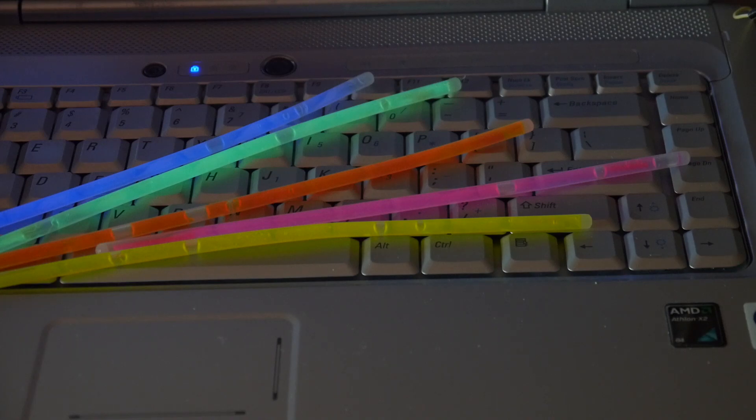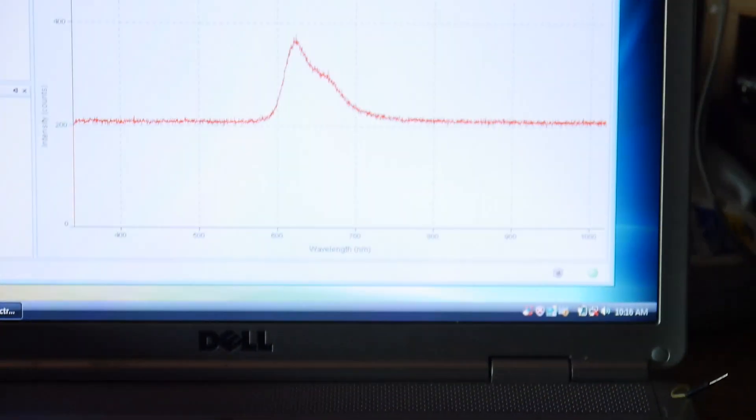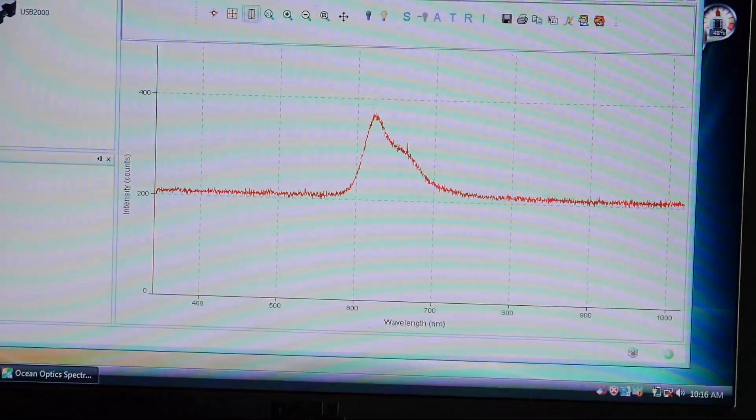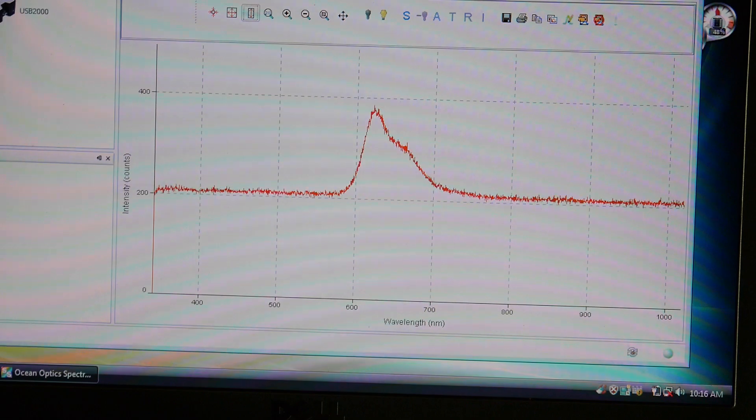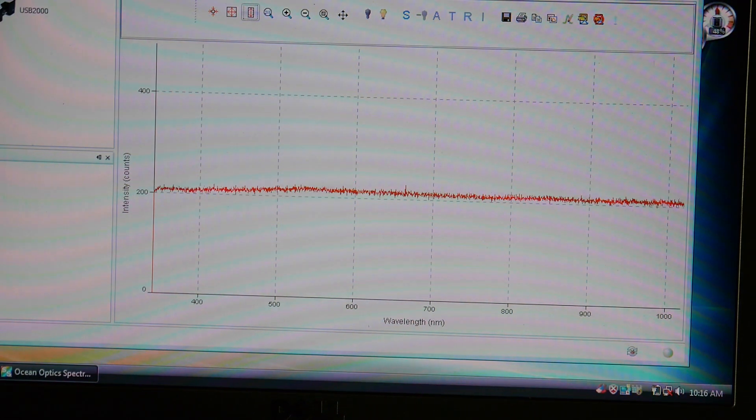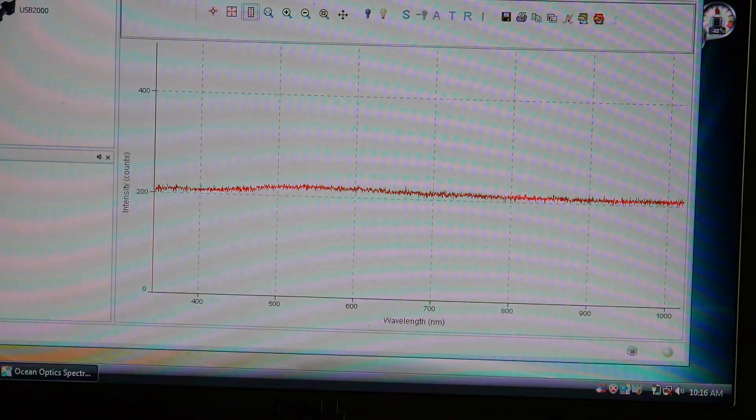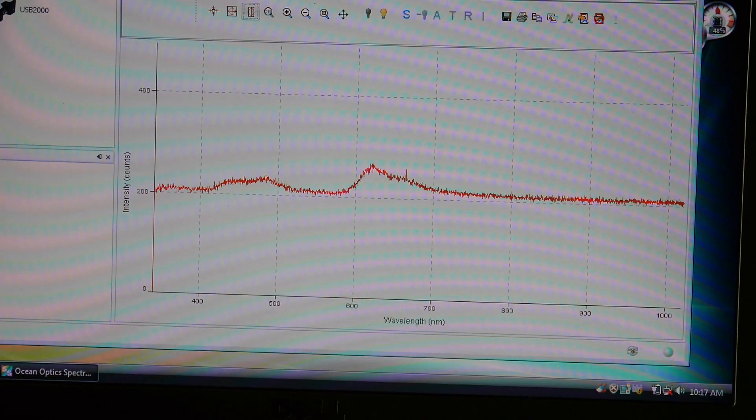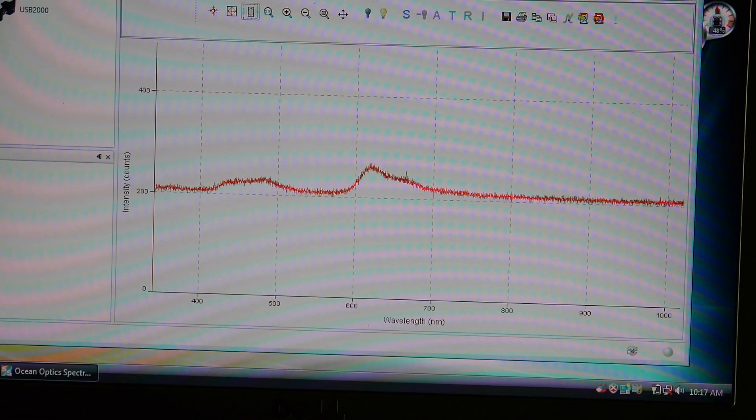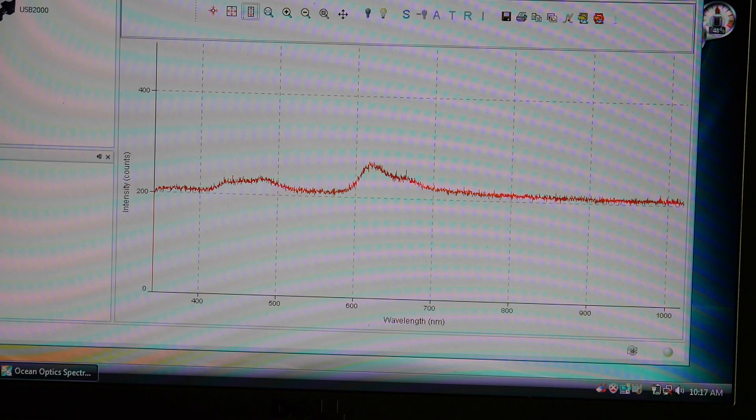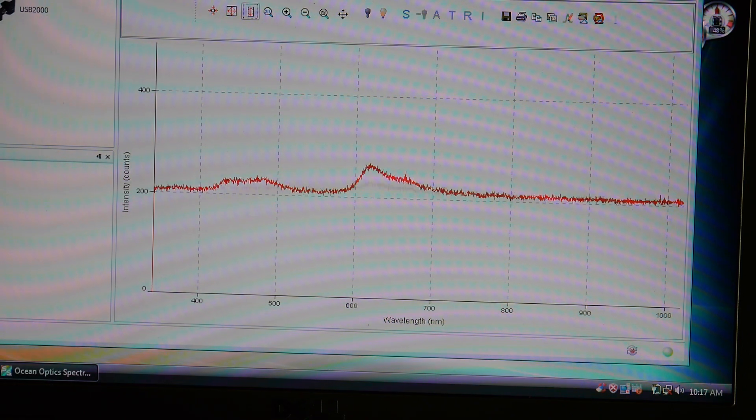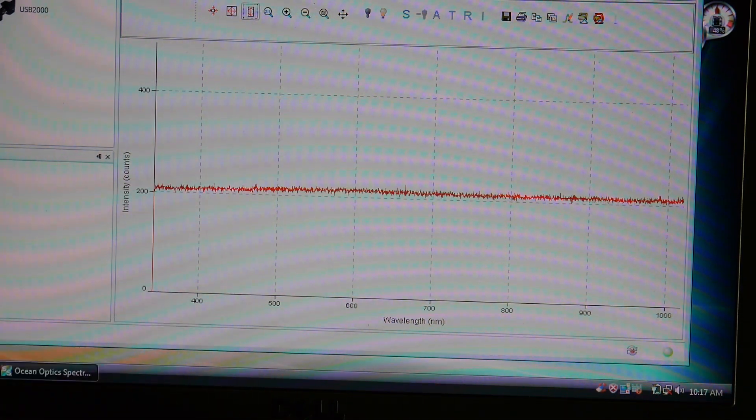And that's the red that we've already seen before in the purple one. So here's the red one and here's the purple one. So it's the same chemical, just it has blue in it also that makes it purple. So yeah.